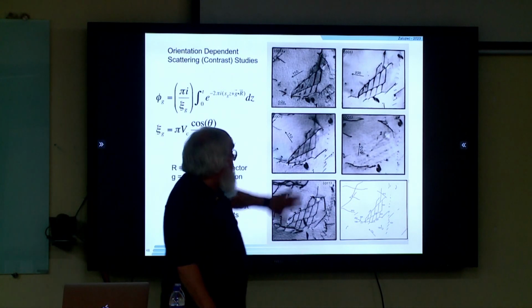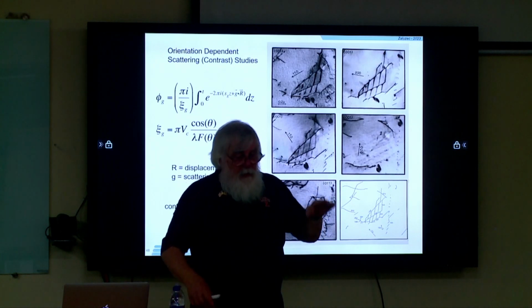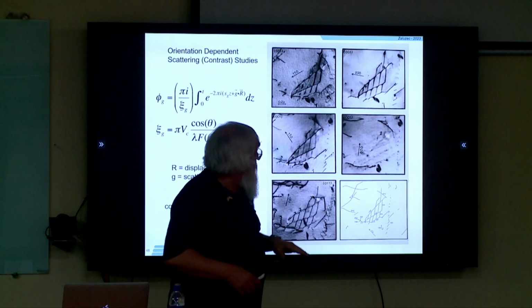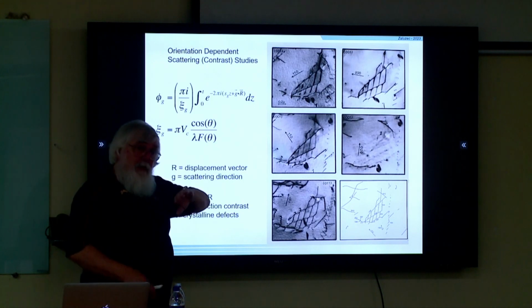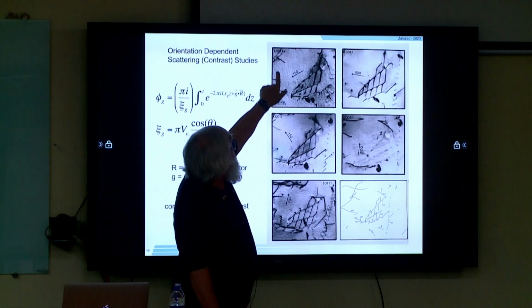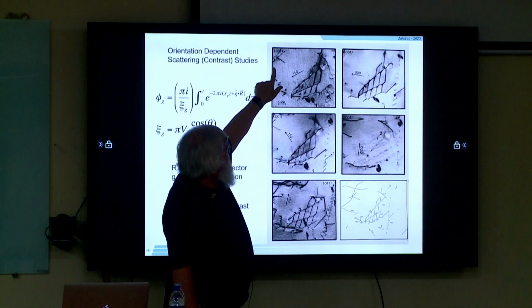Now, this is a systematic study. Remember we talked about yesterday how the Kikuchi patterns let us go between different areas of the crystal. Well, I did that in this particular sample. I tilted the crystal. I used the Kikuchi patterns. I found this area. In this case I'd orient near the 001 axis.